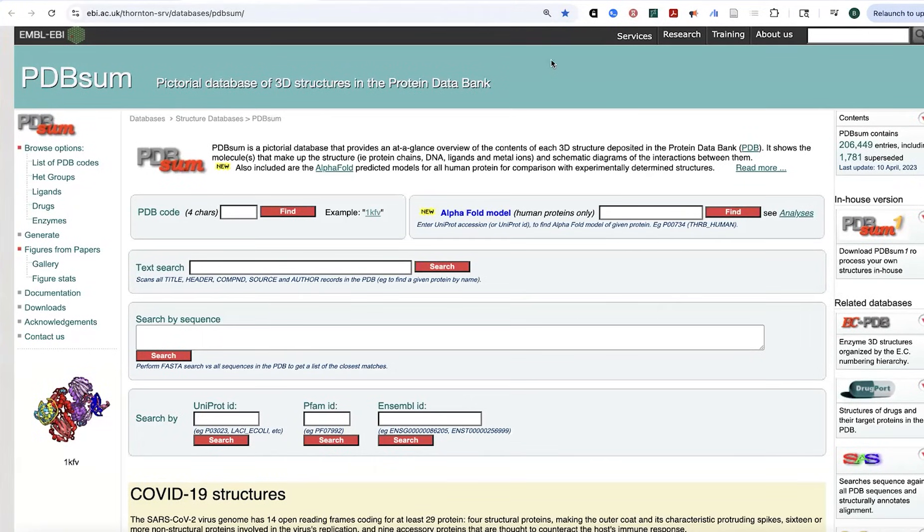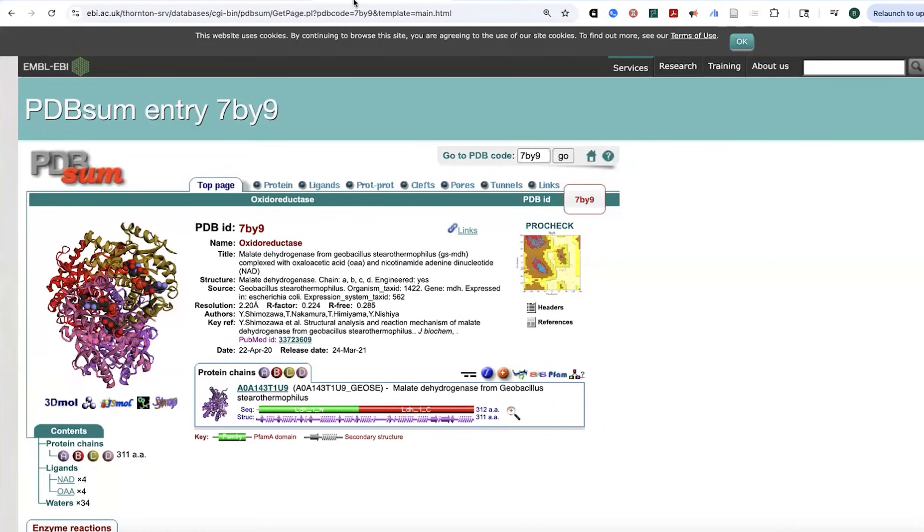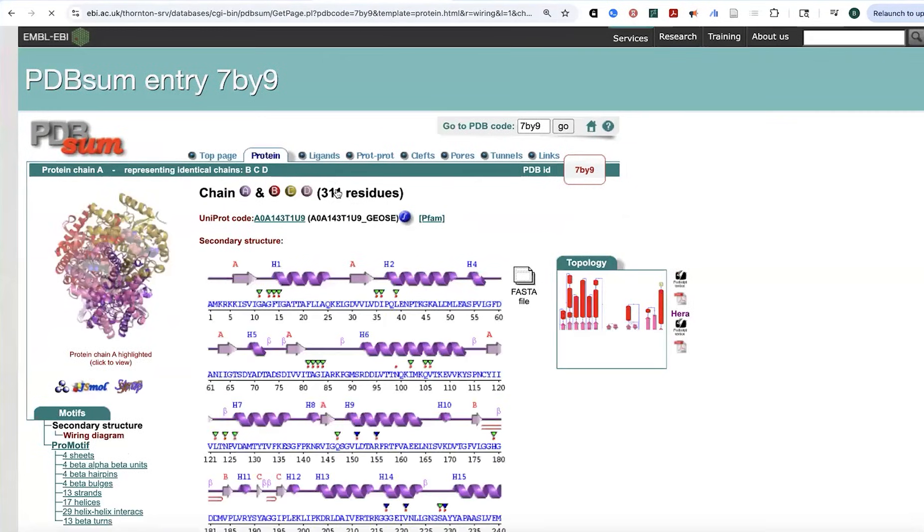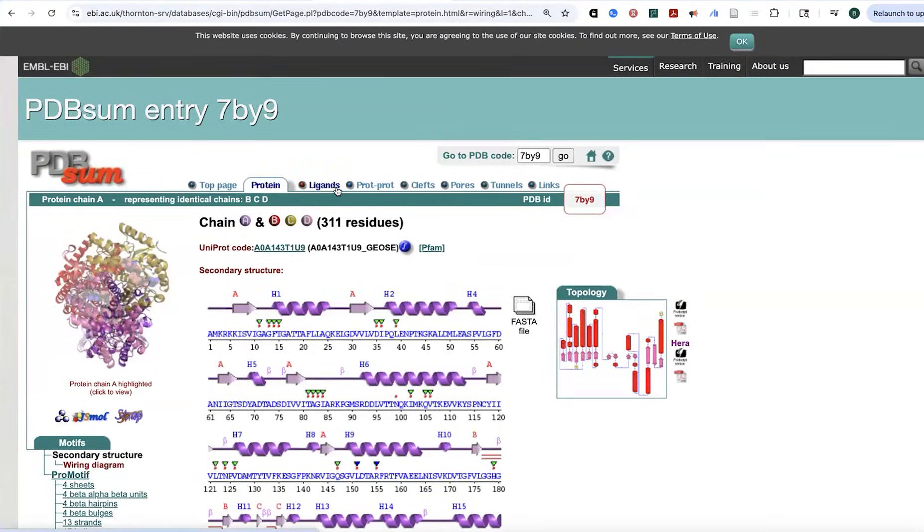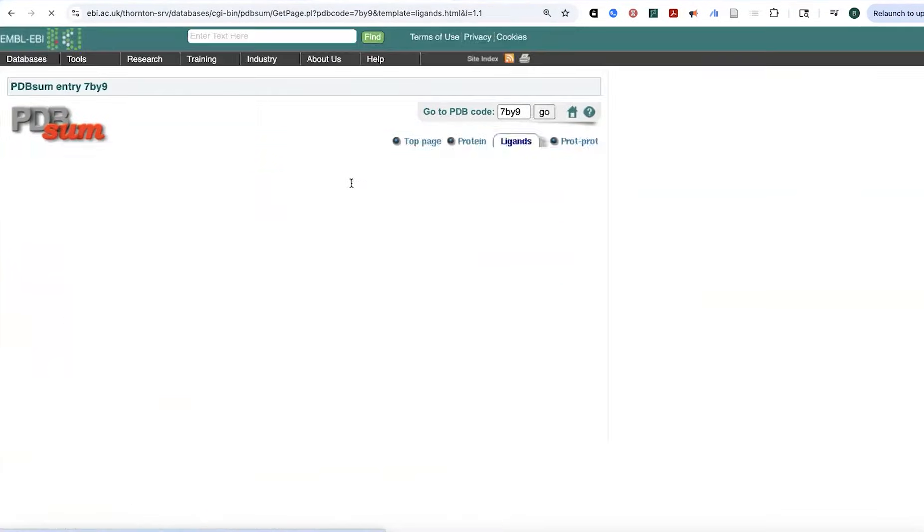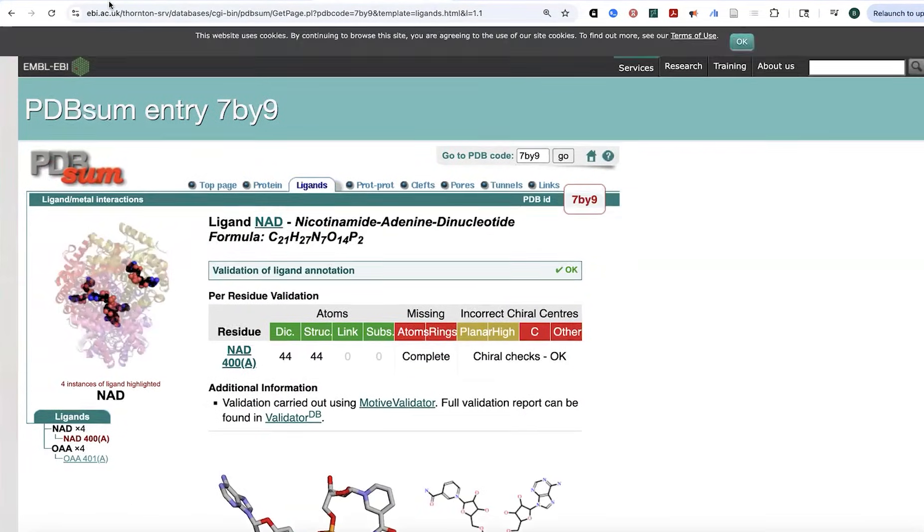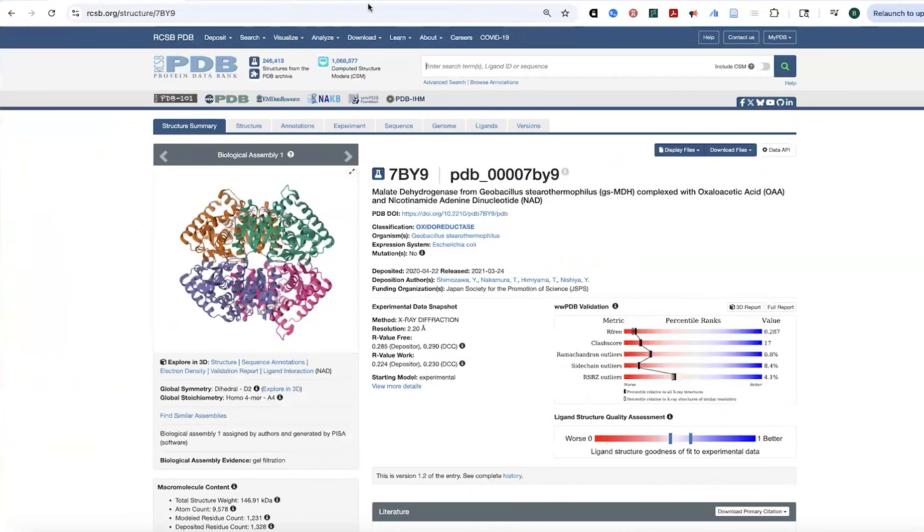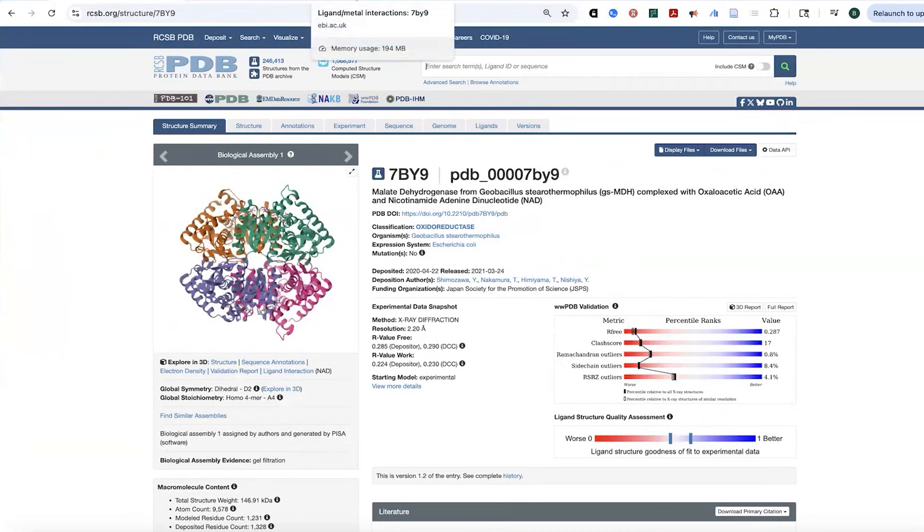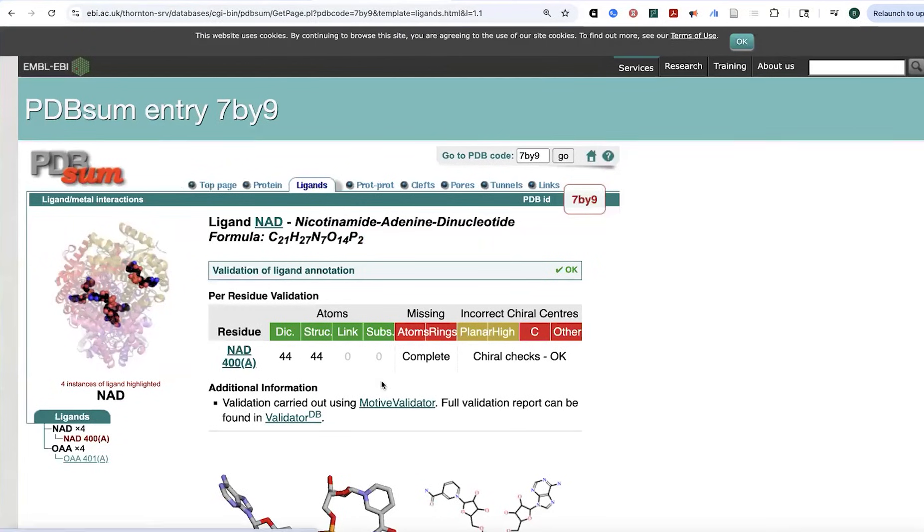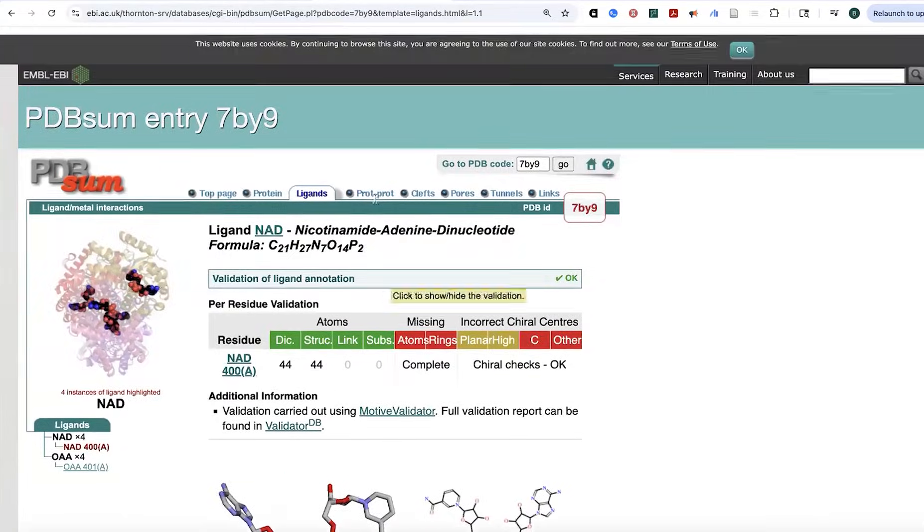One of the coolest structural biology tools that you might not have heard of is this site called PDBSUM. It will take a PDB file, either one that has already been solved and is in the PDB, so the protein databank, or one that is predicted or one that you upload yourself.